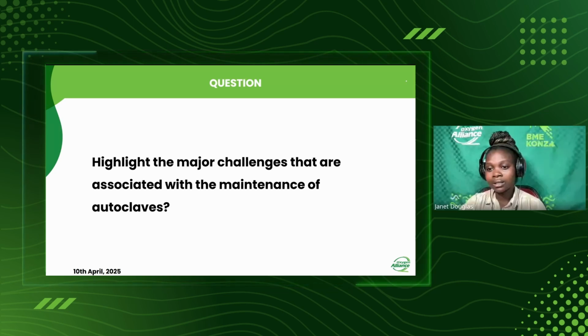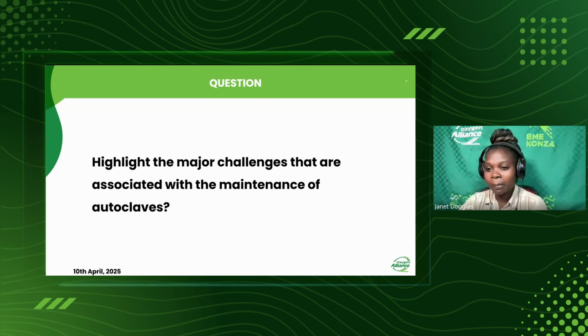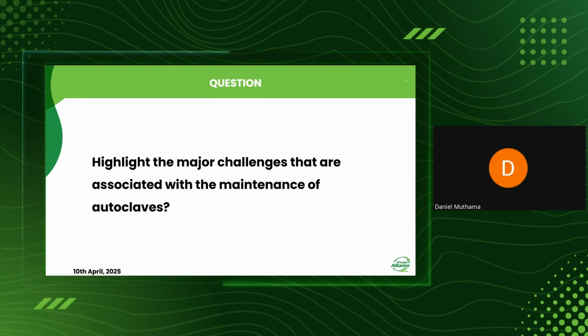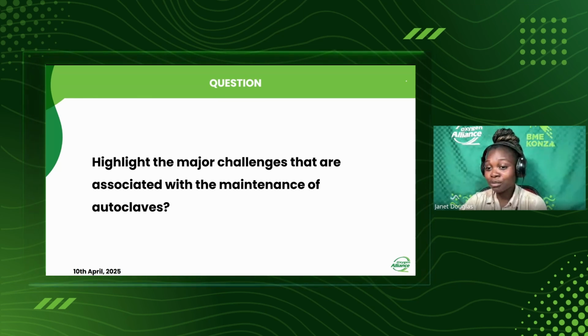Andes gave us a comment to say, it looks like her mic is not going on well. She's a biomedical engineering student in Cameroon, and she's saying, I've had some experience with autoclaves in my internship. The challenge I faced is shocking on the body of the autoclave, overheating, and also very high pressures. So she mentioned shocking on the body of the autoclaves, overheating, and also high pressures.